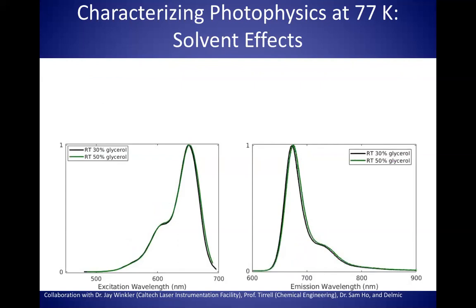Another thing that we're noticing is solvent effects. All fluorophores respond to their chemical environment. These responses are often very subtle, especially for modern fluorophores that have been optimized to be more stable and robust. And so here I'm looking at Alexa Fluor 647 again. It's in a phosphate buffer, and I'm simply toggling between 2 amounts of glycerol.